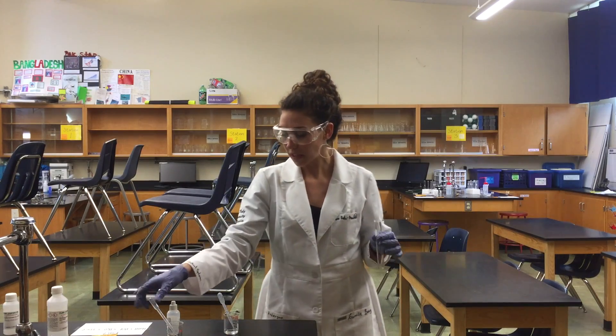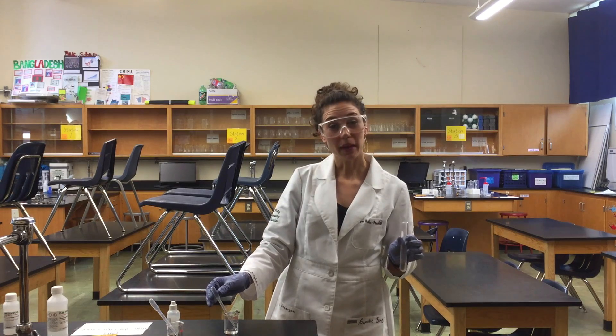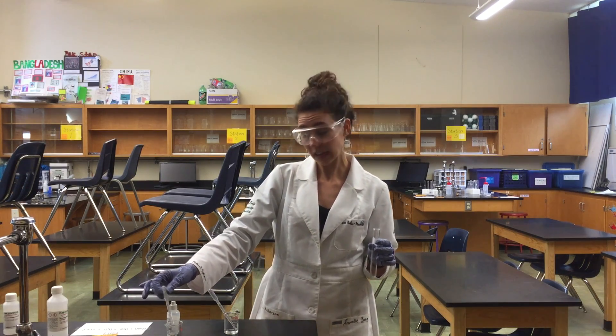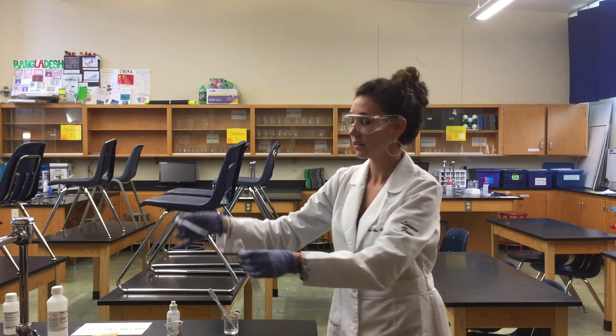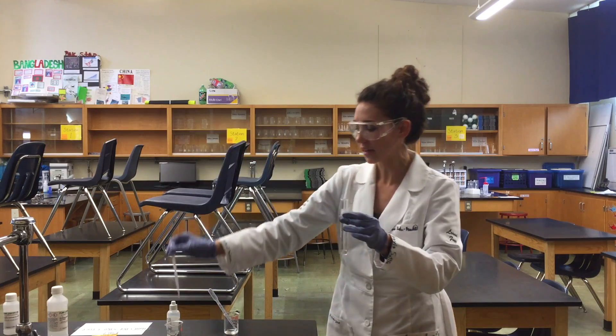At this station you will be reacting hydrochloric acid with sodium hydroxide. We're going to start with our HCl, or hydrochloric acid, and I'm going to start with about a milliliter of our acid.